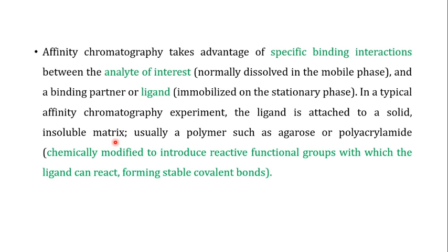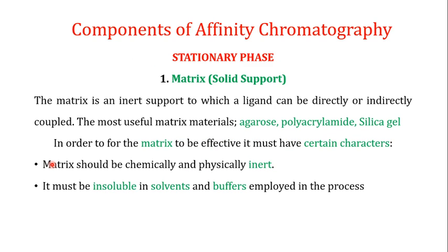These matrices usually are polymers such as agarose or polyacrylamide, and they are usually chemically modified to introduce a reactive functional group with which the ligand can react, forming stable covalent bonds. So you can immobilize the ligand on the stationary phase, and then use this ligand for the separation of your desired protein or biomolecule.